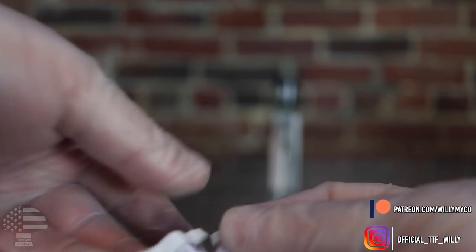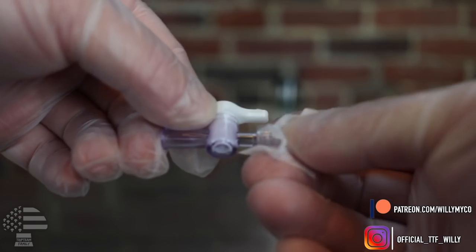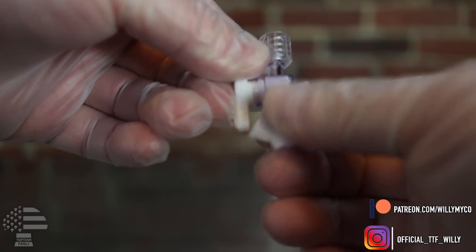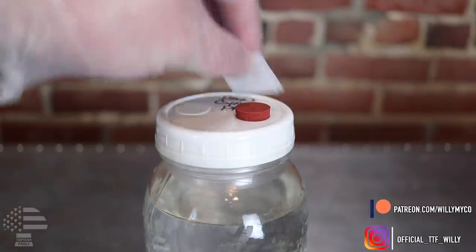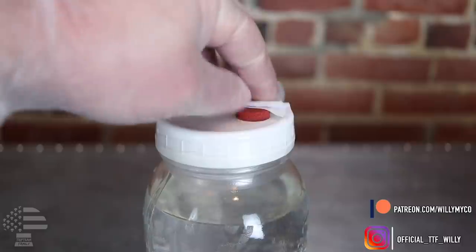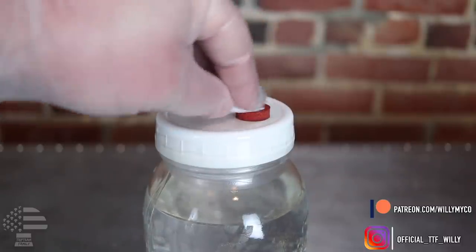Next, take your stopcock and wipe it down with isopropyl alcohol — make sure it evaporates before you actually use it. Just like the LC needles, the stopcocks are not sterile, so wipe them down really well and give them a chance to evaporate. Then prep your LCs: take isopropyl alcohol and wipe down the self-healing injection port, around the lid, and on top of the lid — you want to get that entire area. You never know where there might be dust or spores, so the better you wipe it down the cleaner you'll be.